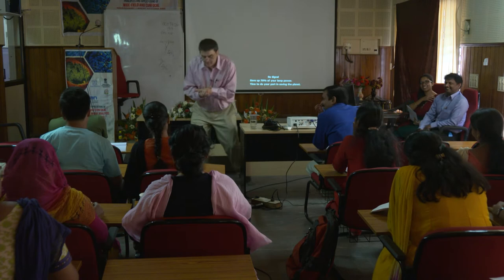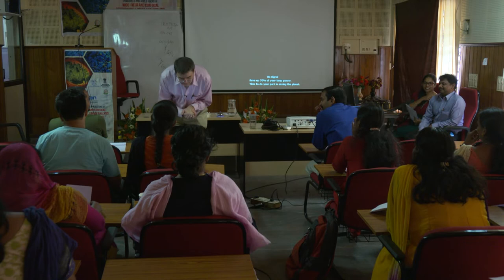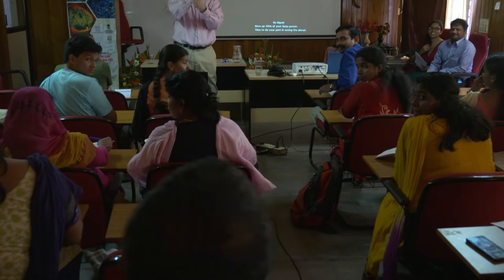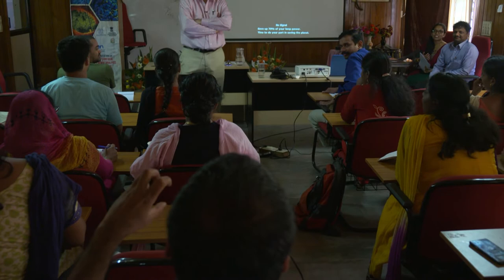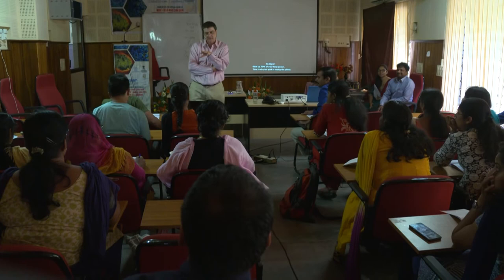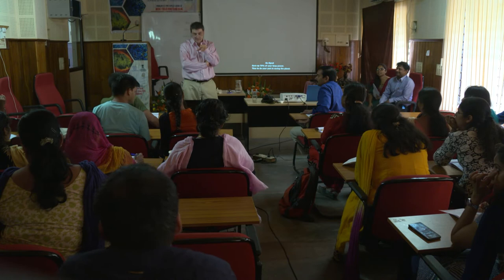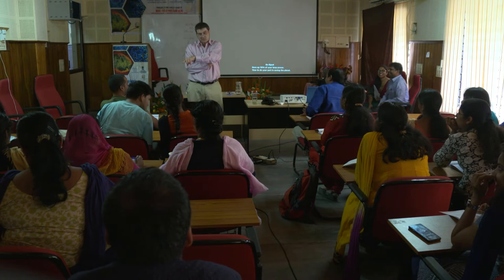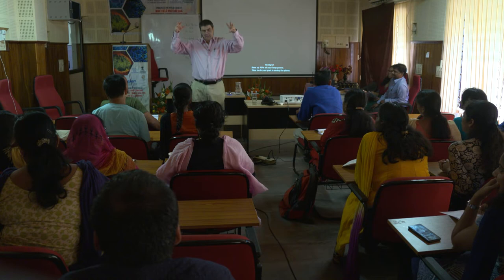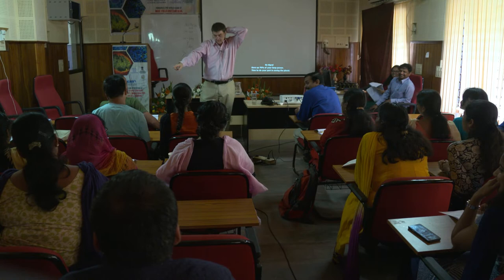Okay. Next question. From yesterday: what does deconvolution do? Using software, we can increase the specificity of a proposed image. Right, but what's a little bit more about it? In what context did I use it? 3D. To some extent, it's a poor man's confocal, right? It doesn't have a pinhole. That's right, you're using wide field to start with.